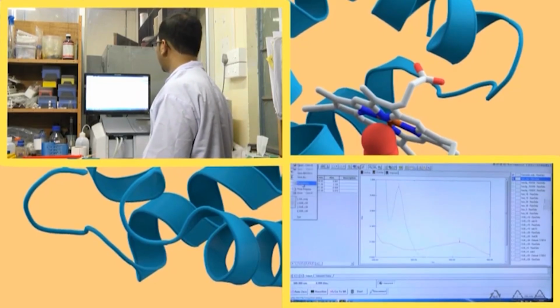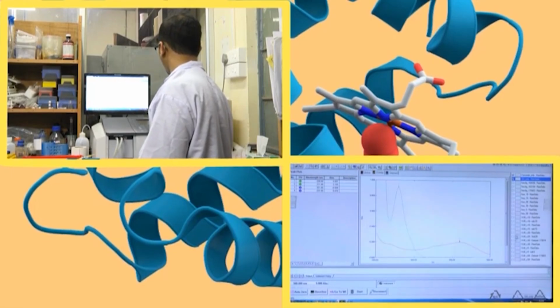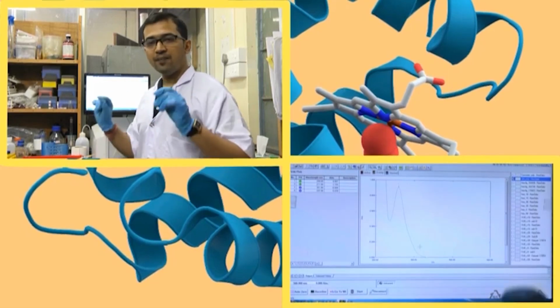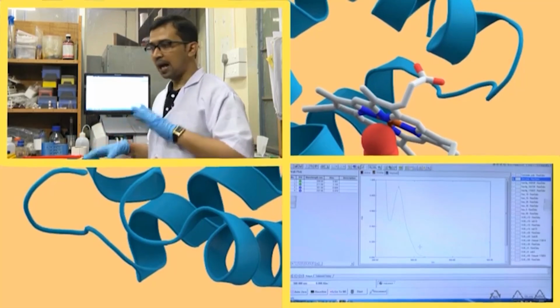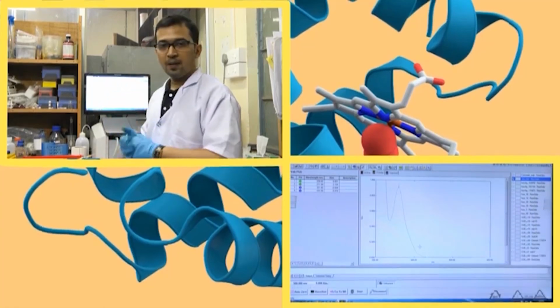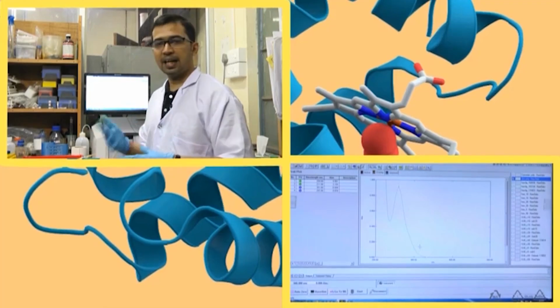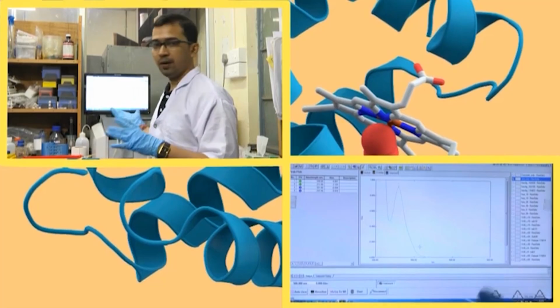in this file and saving it also as a text file, and disabling this curcumin 1 and enabling this gallic acid. Now, what I will do is add HSA to it and see how it changes. Since we have first seen how the HSA changes in the case of curcumin, here we are taking selectively a few concentrations of HSA like 10, 20 and 30 or 50, and we will see how the spectra changes.